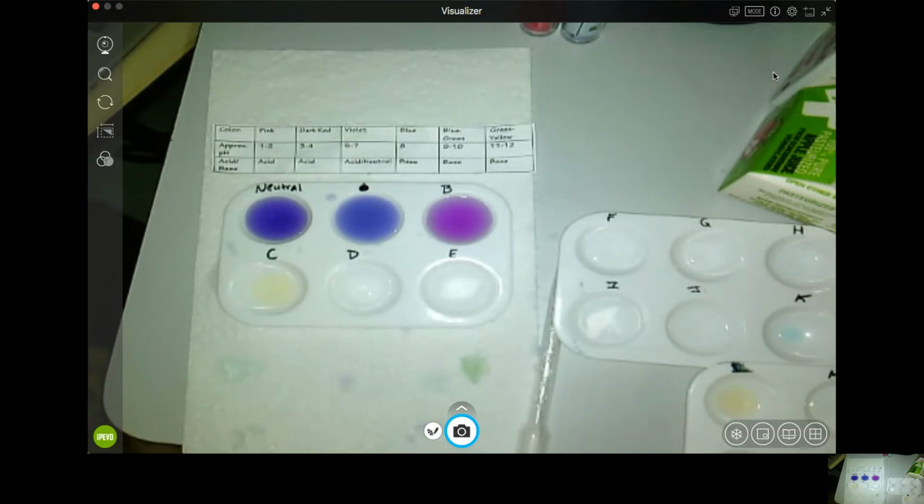I wonder if I got some. Oh, that one was apple juice. That's why. I was thinking it was lemon juice. Thinking that should be a lot pinker. I flip-flopped them. But that's the violet, so where should you put apple juice? Probably around the 5 or 6. It'd be in that 5 to 6 range.